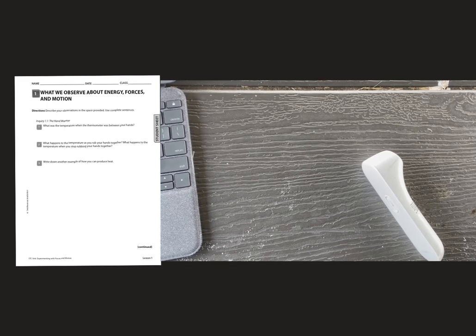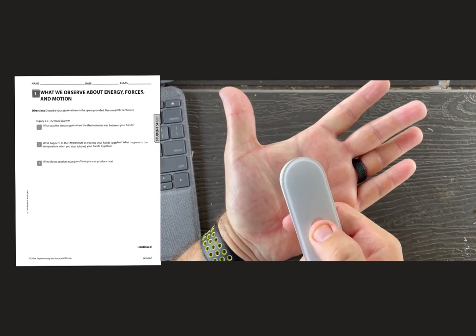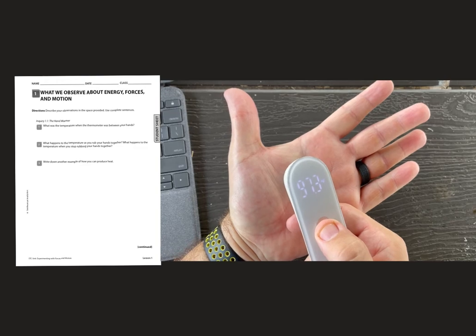All right, so the procedure tells us, number 1, to put the digital thermometer shaft between the palms of our hands for 1 minute and observe the temperature reading. Well, I have contactless, so there's my temperature reading before we start.